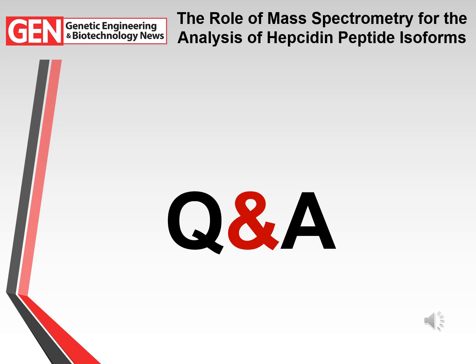Thanks, Rob. Our next question starts off by asking, the freeze-thaw cycle optimization for the Hep25 had the lowest concentration at 0, highest concentration at 1, and an average for 2 to 4 freeze cycles. Can you explain this behavior, and do the freeze-thaw cycles create higher solubility and hence higher concentration for free Hep25?